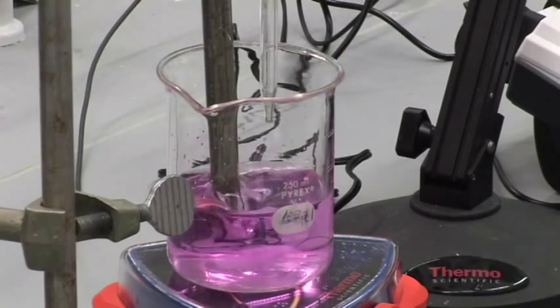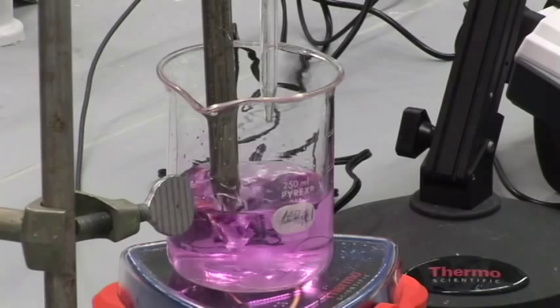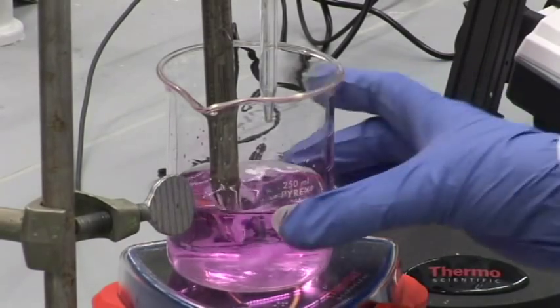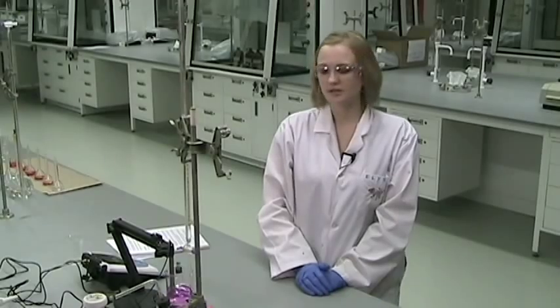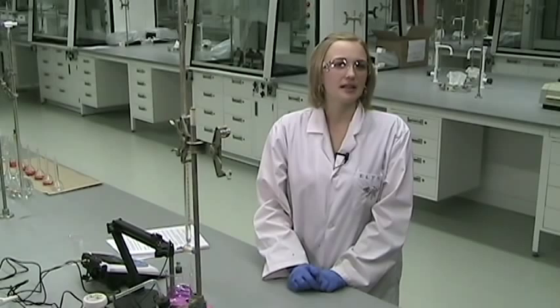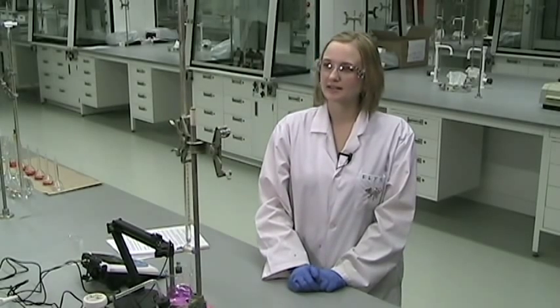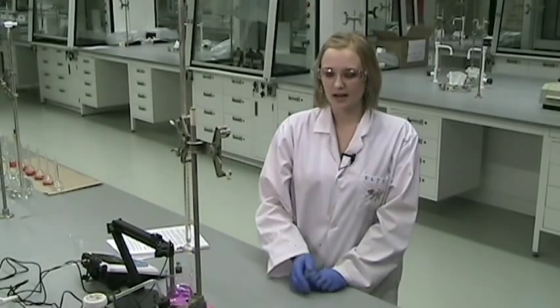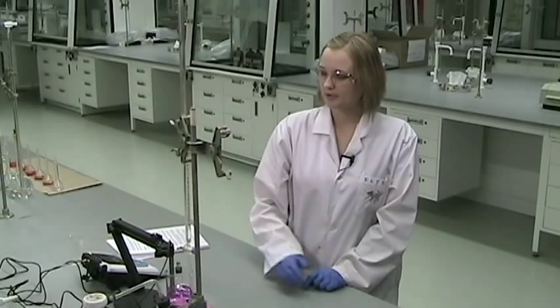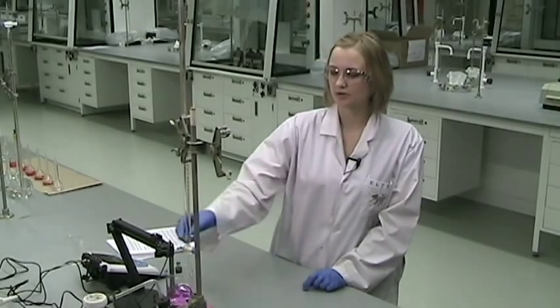All right, so when you've added enough base to reach the end point of the titration or the equivalence point, you'll see the color change from clear to pink. Make a note of at what point and what pH and what volume the color does change. You may see it a little bit lighter at first, but because in a strong acid, strong base titration, the pH changes very quickly when you get to the equivalence point. You may just see a really sharp jump in pH, and the color will change really quickly.